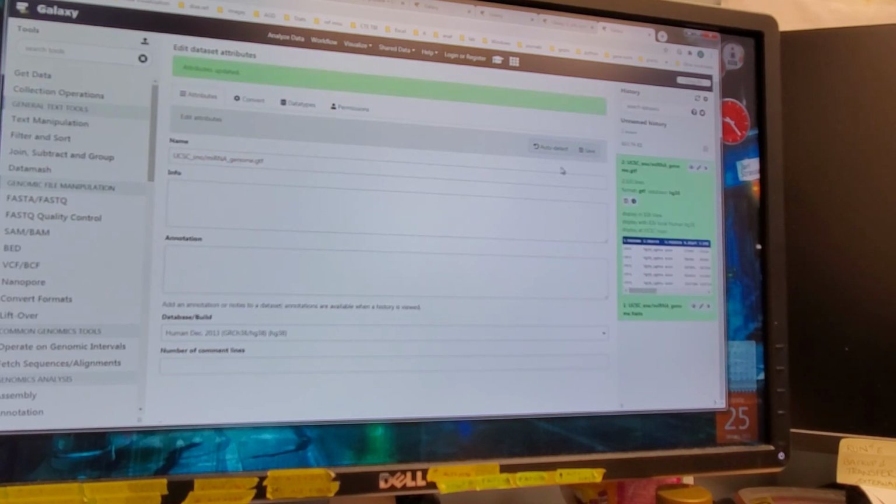save. Okay, you'll notice that with a lot of stuff in bioinformatics, you never use spaces, you use underscore. That's because if you have to use command line, you don't use spaces, pretty much. You try and avoid spaces. So underscore, sometimes it'll change it itself.